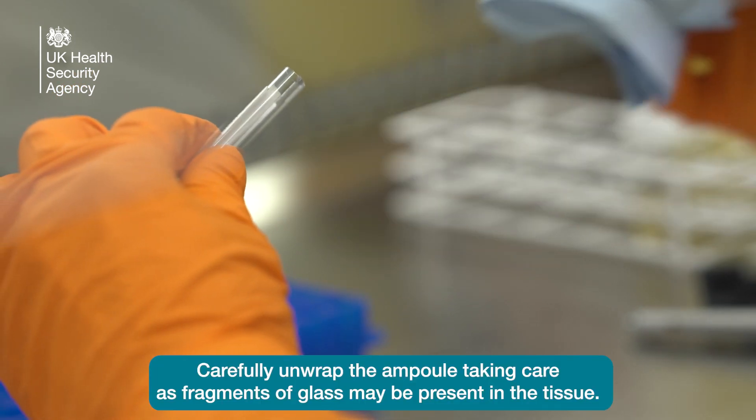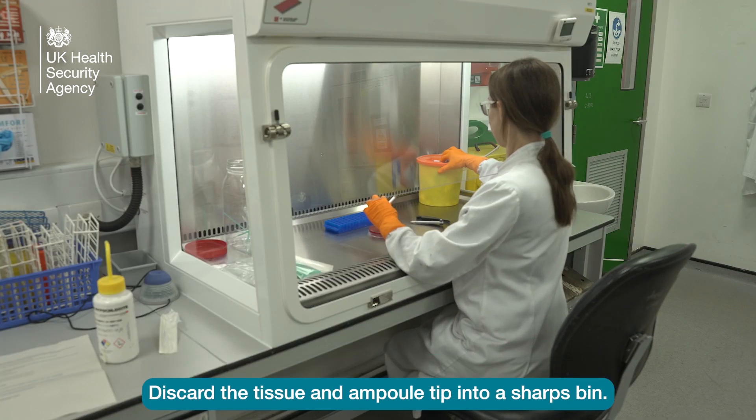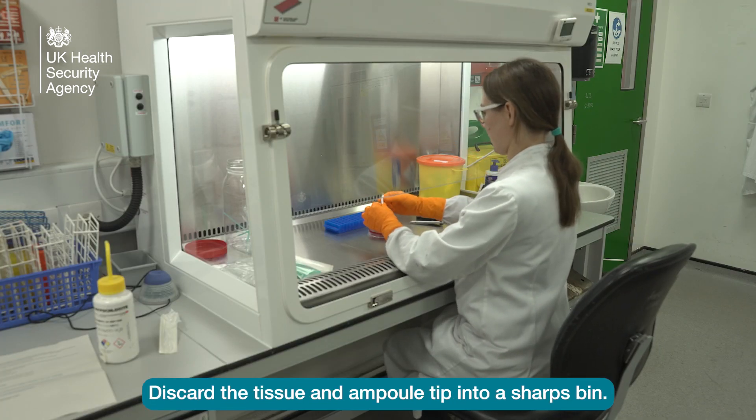Carefully unwrap the ampoule, taking care as fragments of glass may be present in the tissue. Discard the tissue and ampoule tip into a sharps bin.